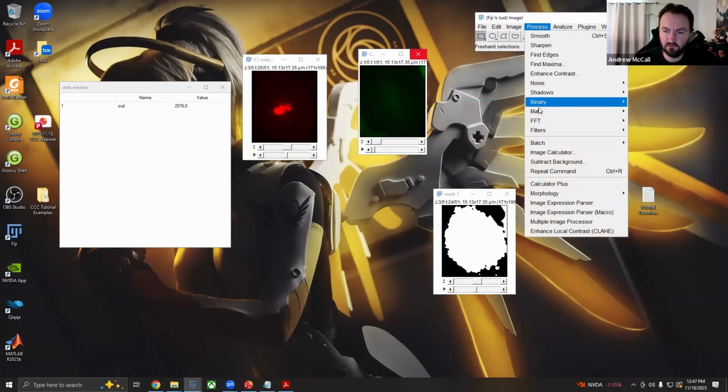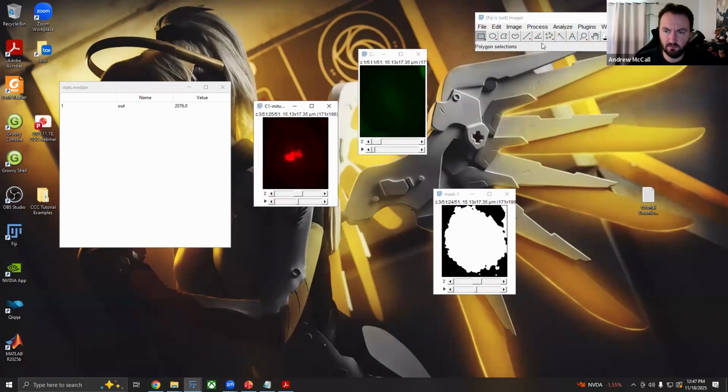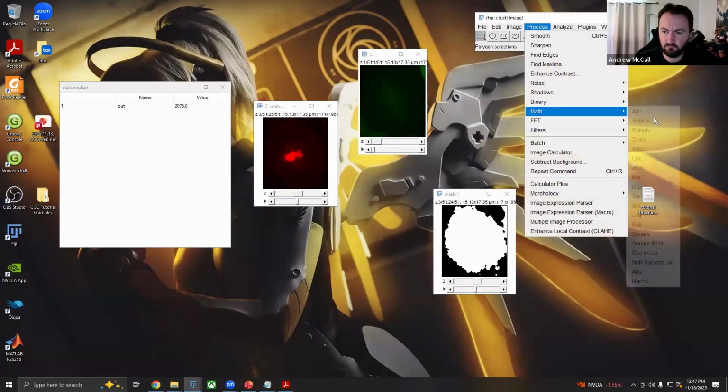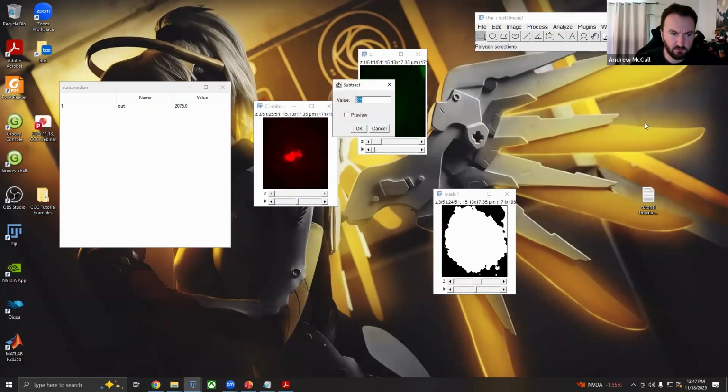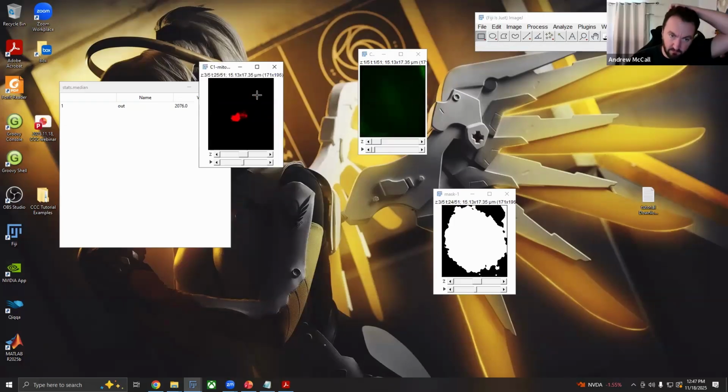Anyway, we will go Process, Math, Subtract. Actually, I'm going to make sure I selected that image last. I don't want to mess this up. Math, Subtract, 2076. Click OK. Yes. And there is our background subtracted, right? And so that is just getting the background here to around 0, which is what we want, okay?